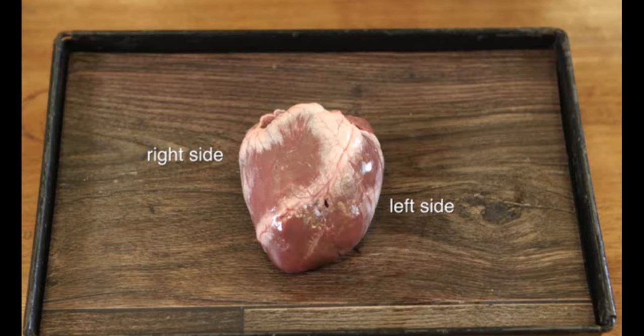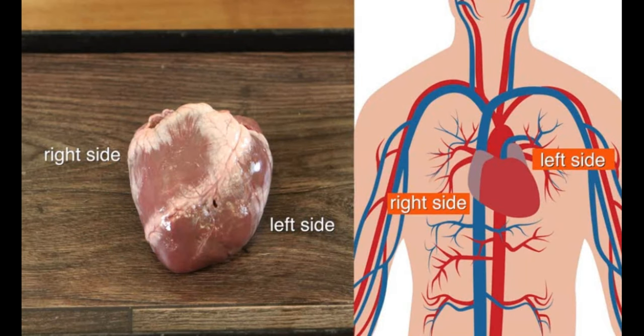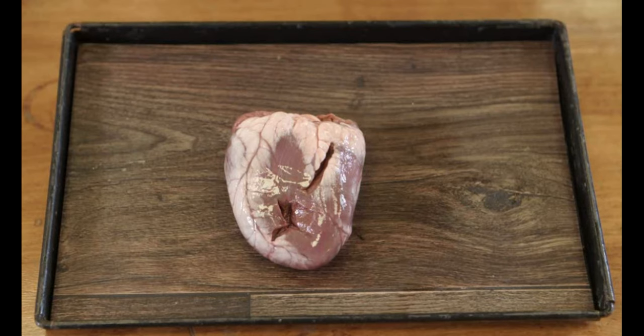This is the front facing view of the heart. This is how it sits in the body if you are facing the person whose heart it is. This is the back of the heart.